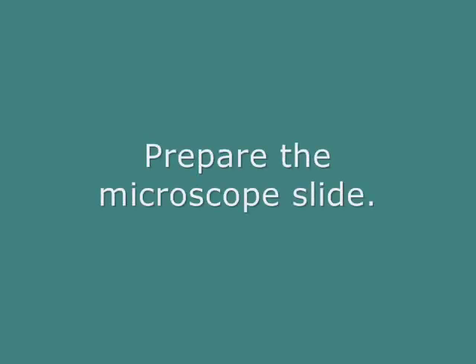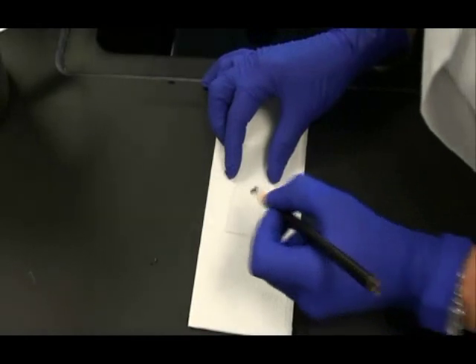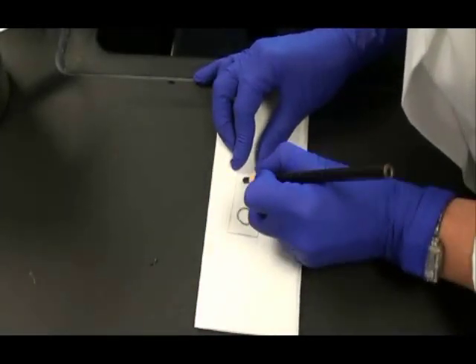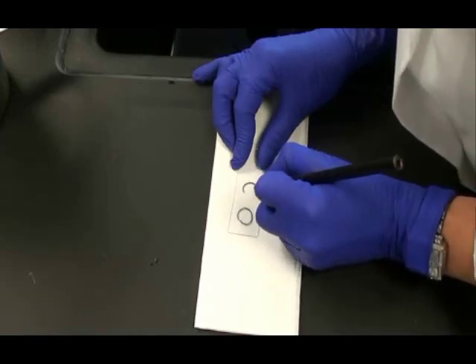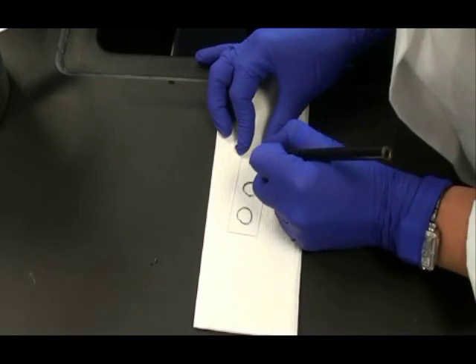First we need to prepare the microscope slide. For this stain we're going to have two controls and an unknown. So I need to draw three circles on the microscope slide using a wax pencil.